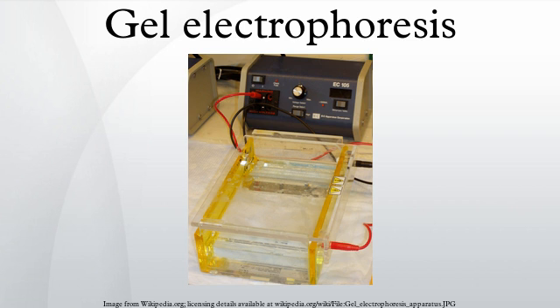Single-stranded DNA or RNA tend to fold up into molecules with complex shapes and migrate through the gel in a complicated manner based on their tertiary structure. Therefore, agents that disrupt the hydrogen bonds, such as sodium hydroxide or formamide, are used to denature the nucleic acids and cause them to behave as long rods again. Gel electrophoresis of large DNA or RNA is usually done by agarose gel electrophoresis. See the chain termination method page for an example of a polyacrylamide DNA sequencing gel. Characterization through ligand interaction of nucleic acids or fragments may be performed by mobility shift affinity electrophoresis.